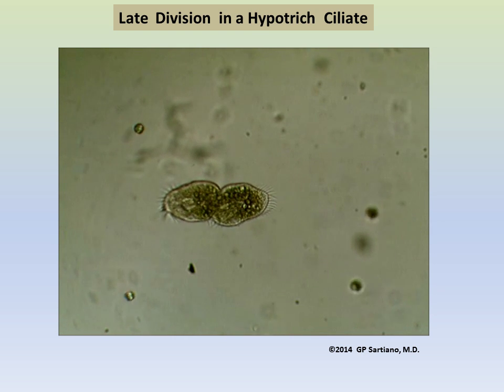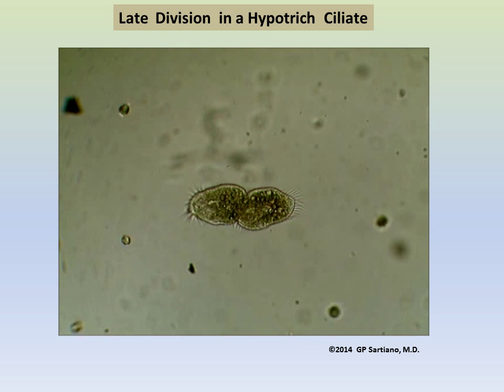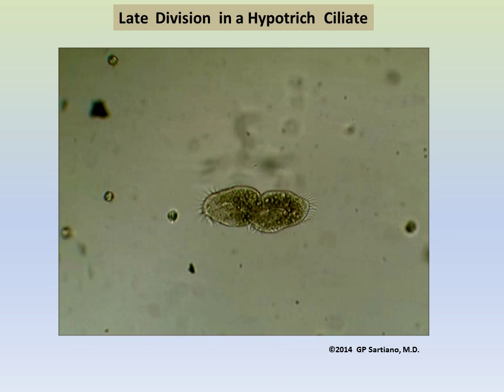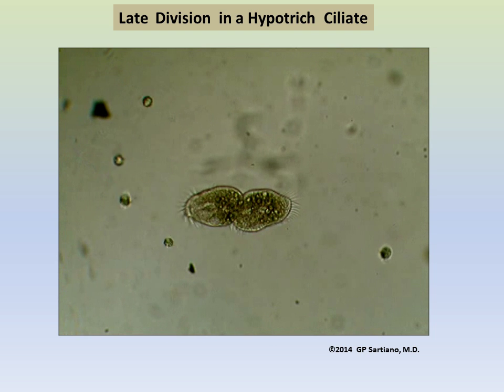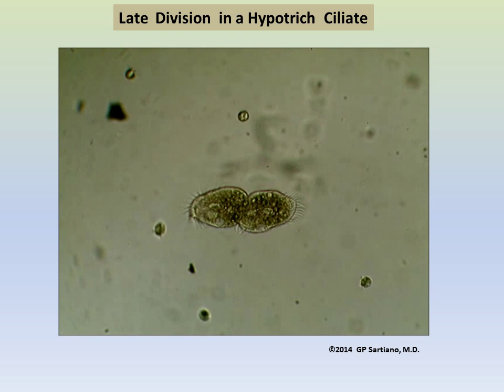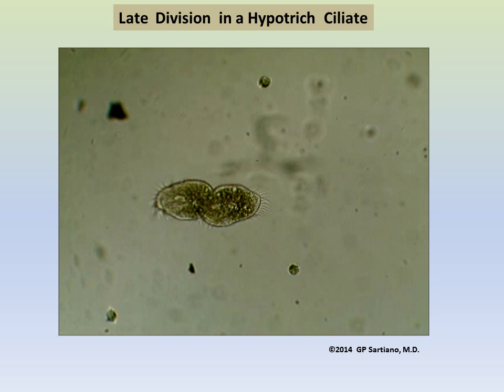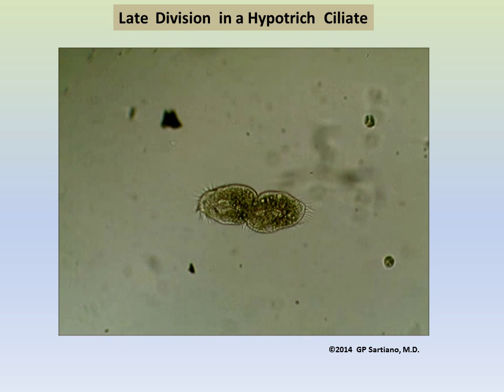During this next period of the video, the organisms that are developing together will be more or less immobilized or stable, and this will provide an opportunity to verify all of the aforementioned observations.